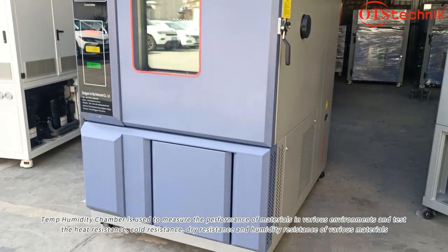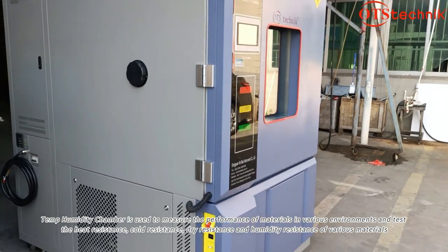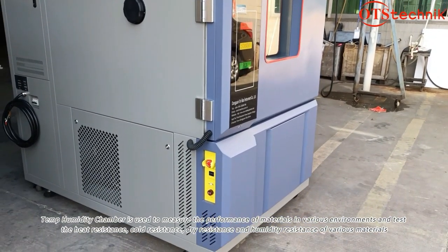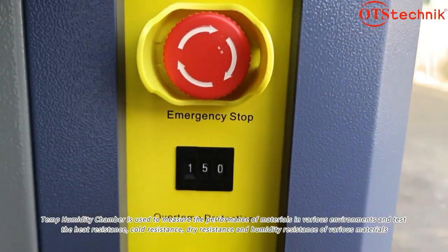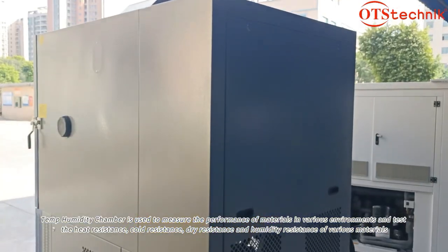A temp humidity chamber is used to measure the performance of materials in various environments and test the heat resistance, cold resistance, dry resistance, and humidity resistance of various materials.